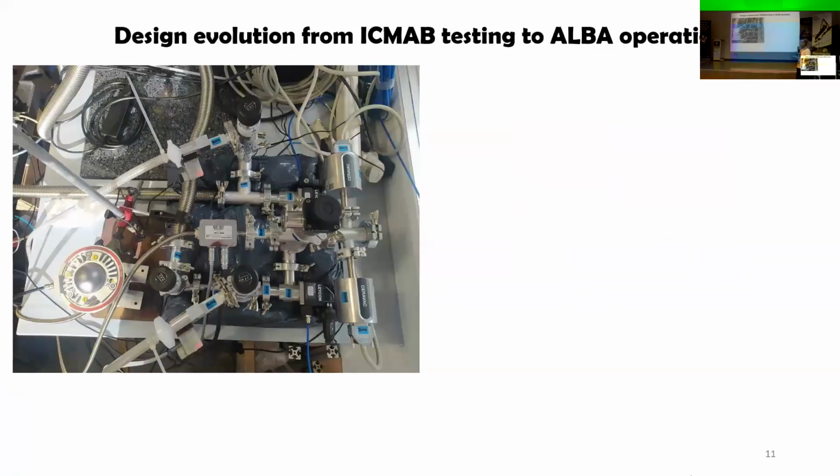So I would like to just briefly show you how the design and building of this evolution went here from ICMAB. First, we started assembling everything in one of the laboratories in the MATGAS, where we assembled everything on the bench of the laboratory. You can see this is the Anton Paar hot stage. We just connected it to a set of tubings, needle valves, some gas lines, and pressure readers.